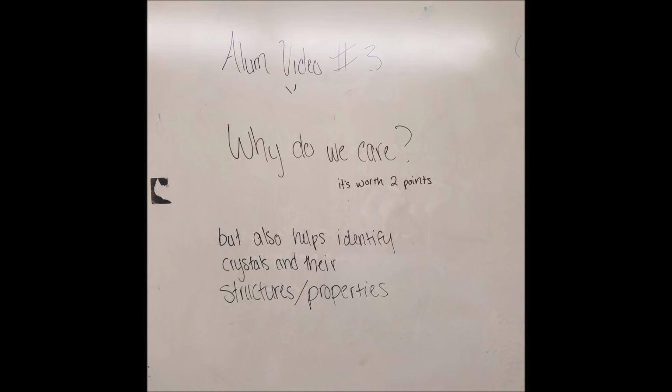Also, we did discover that our crystals had grown. This is important because we know that environmental factors like the increased temperature recently has caused more water to evaporate and the crystals to form at an accelerated rate. We also know that we can use one of these crystals as a seed crystal in order to grow a larger crystal. This is the end of my alum video 3.